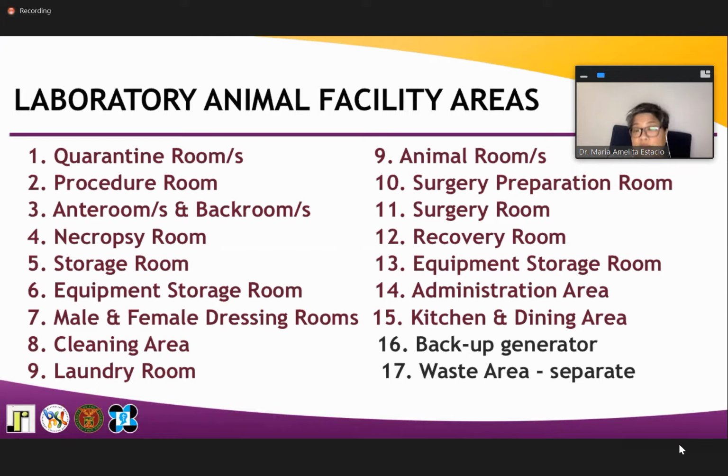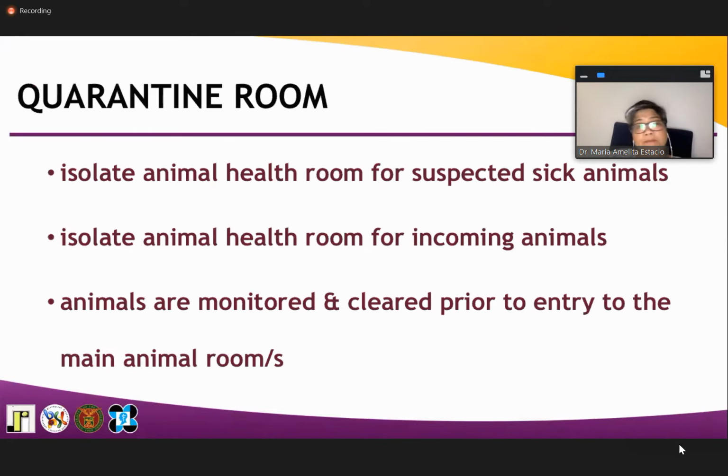the actual surgery room, the recovery room after surgery, the equipment storage room, administration area, kitchen and dining area, and definitely you need a backup generator that can supply the electrical needs of your laboratory animal facility in case of electrical interruption. And there is a separate waste area for the disposal of waste.